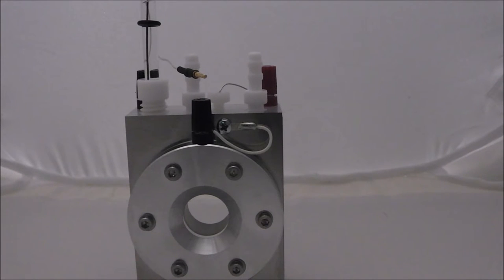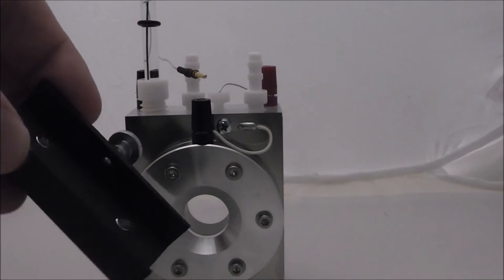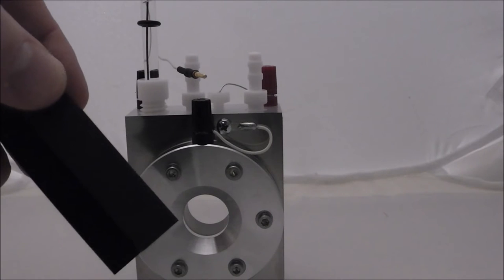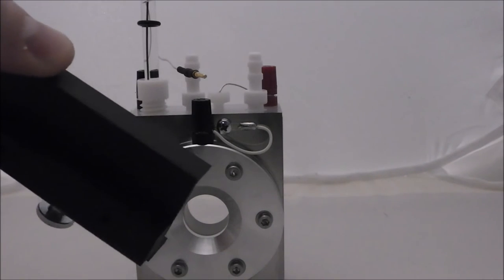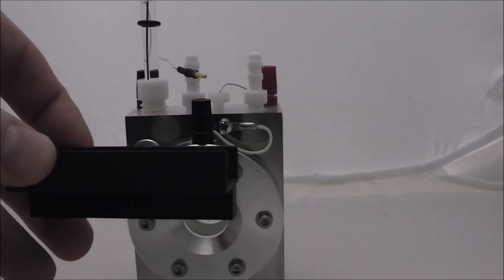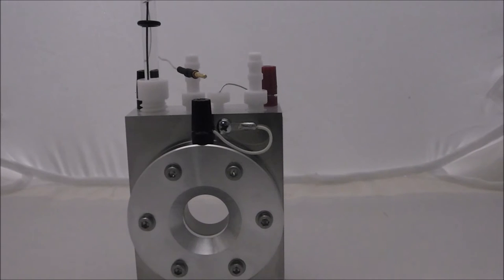They have application notes on solar cells and dye-sensitized solar cells. They give an adapter with the system, and the adapter allows the cell to be put onto a station, so that you can control the position and orientation of the cell, making the experimental setup very repeatable.